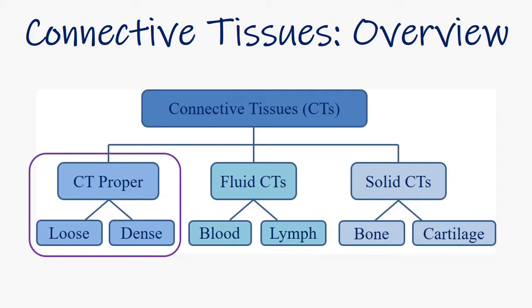Although not all connective tissue propers are composed of collagen, a significant majority of the body's connective tissue is composed of collagen. Indeed, collagen is the most abundant protein in the human body. So today we will use a collagenous tissue as the primary example of a CT proper. The collagen fibers found in connective tissues are produced by cells called fibroblasts. So let's have a quick peek at these cells before looking at examples of collagen itself.